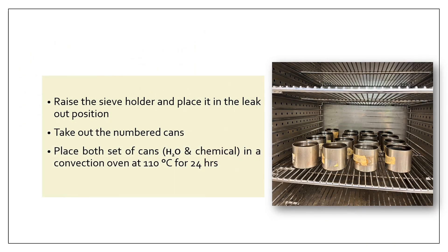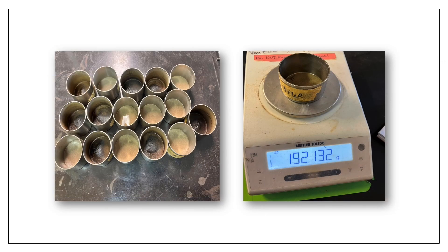Now raise the sieve holder and place it in the leak out position. When there is no water leaking out of the sieves, take out the numbered cans. Now place both sets of cans, that is the water and the chemical ones, in an oven at 110 degrees Celsius for 24 hours or until the water has evaporated. These are the cans with soil after taking out from the oven - now their weights should be taken.